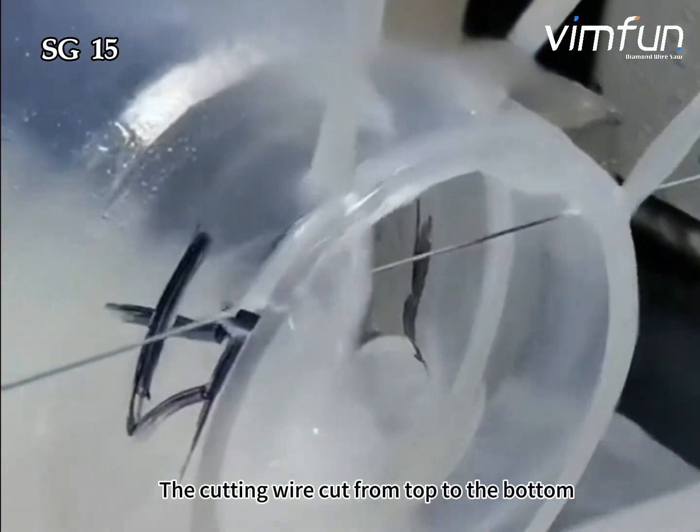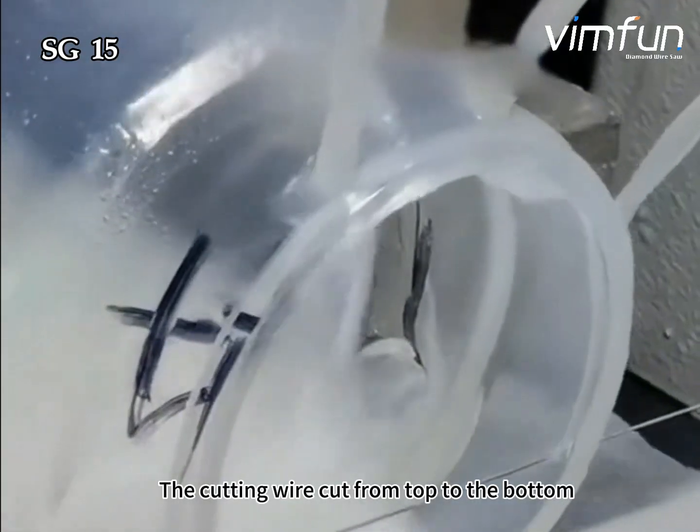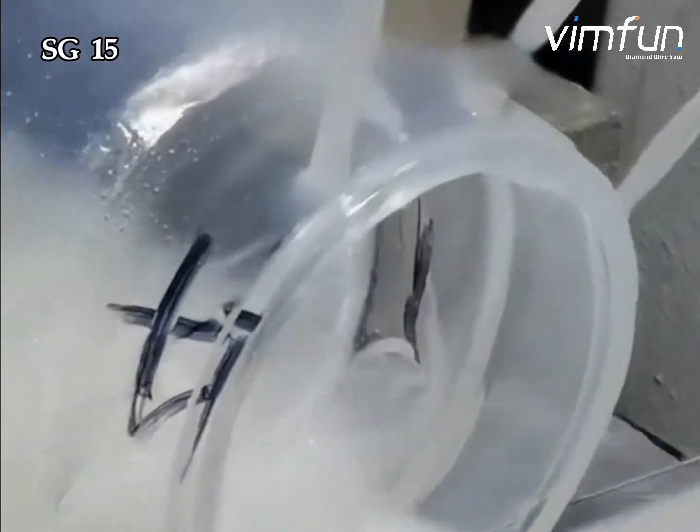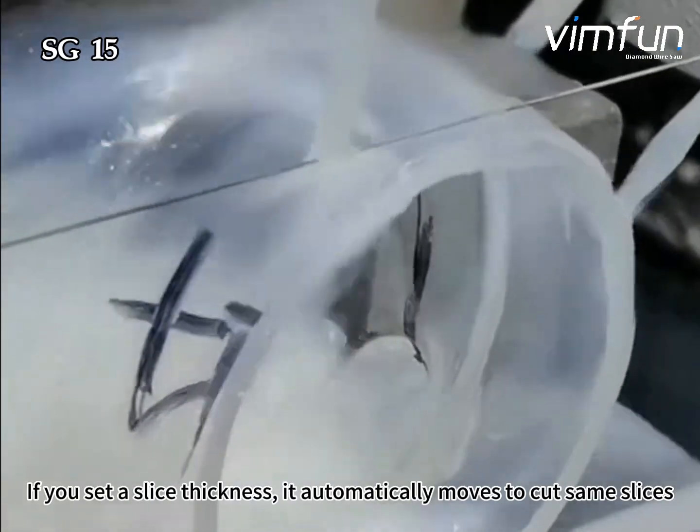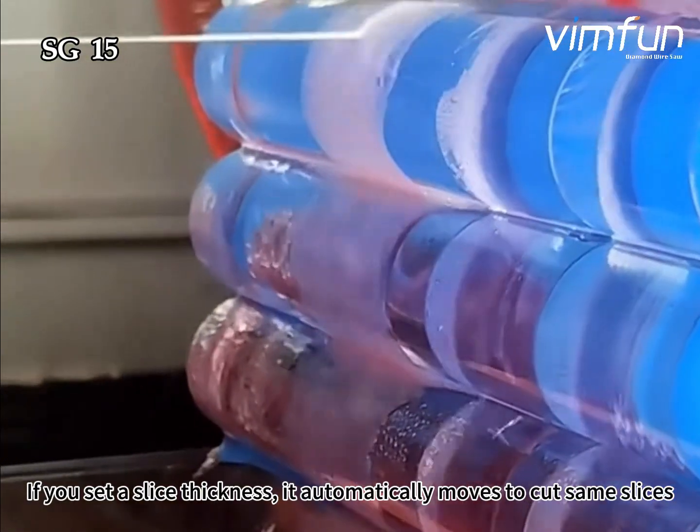The cutting wire cuts from top to the bottom. If you set a slice thickness, it automatically moves to cut the same slices.